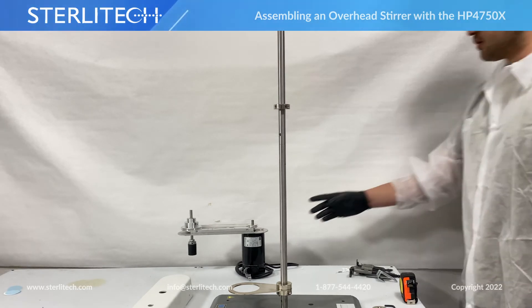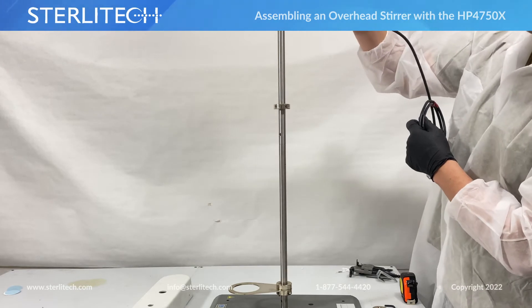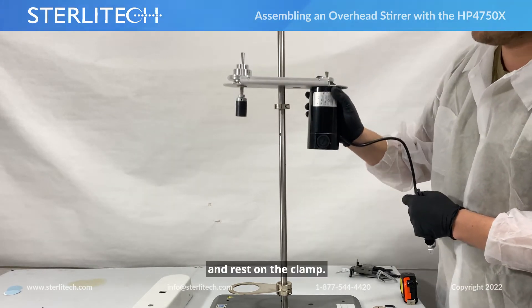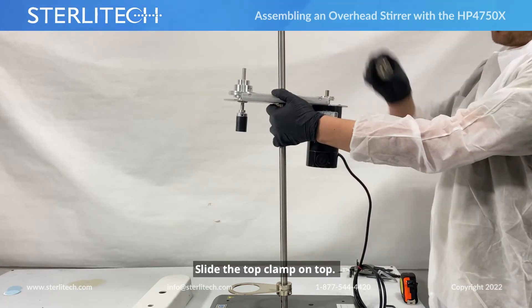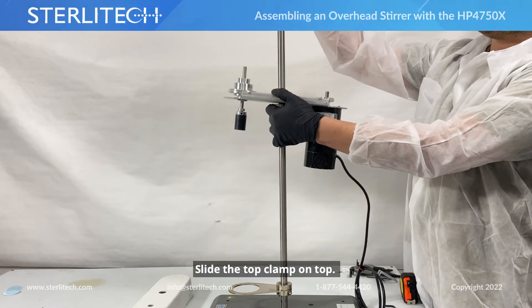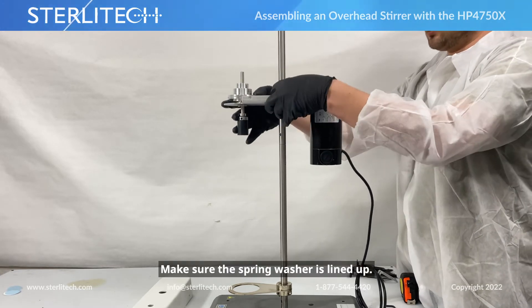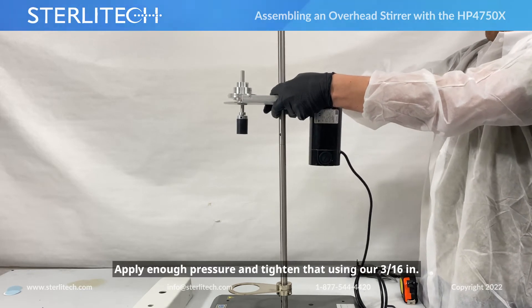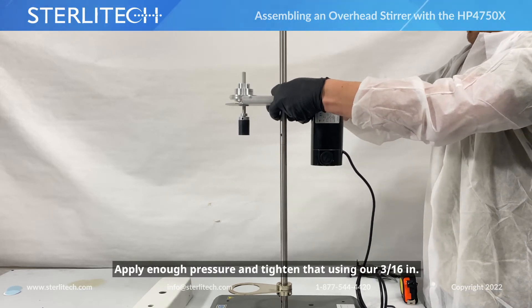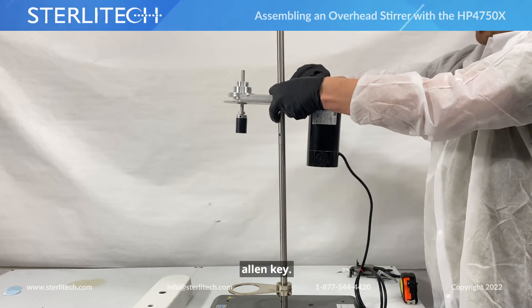Now back to our motor and our pulley — we're going to slide that on top and let it rest on that clamp. Back to our top clamp, slide that on top. There's a spring washer in here, make sure that's lined up. We're going to apply a bit of pressure and tighten that using our 3/16" allen key.